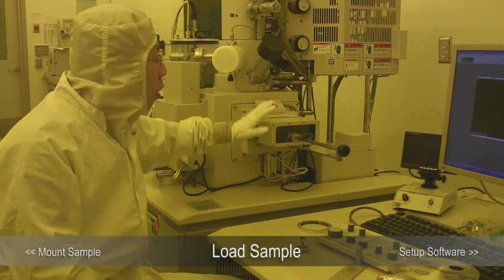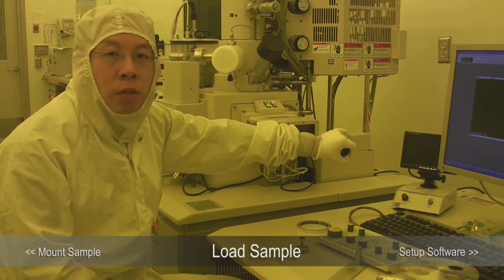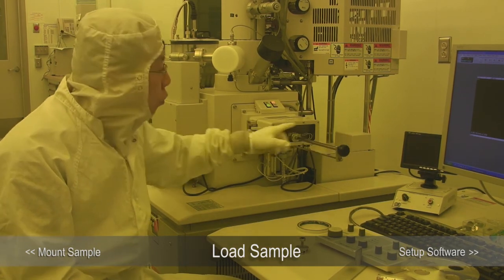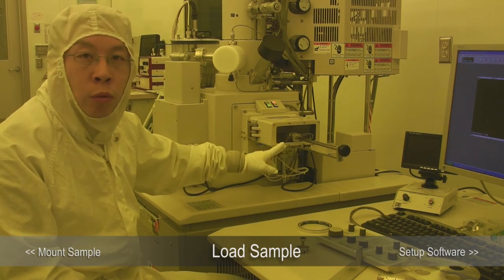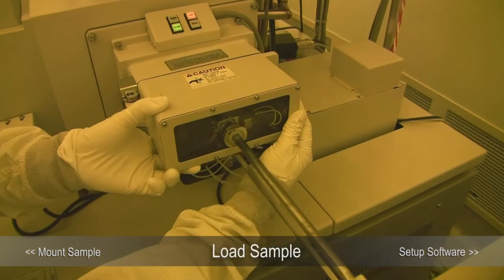You can then open the load lock door. When you open the door, we don't open it by the handle, because if you do that you will bend the exchange lock and create a leak. When you open the door, you want to open it with two hands.